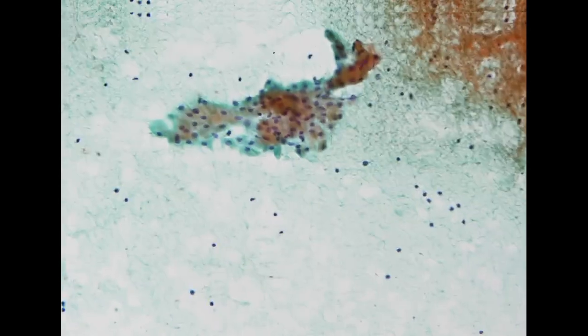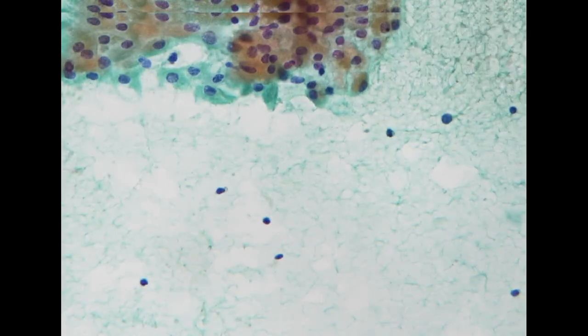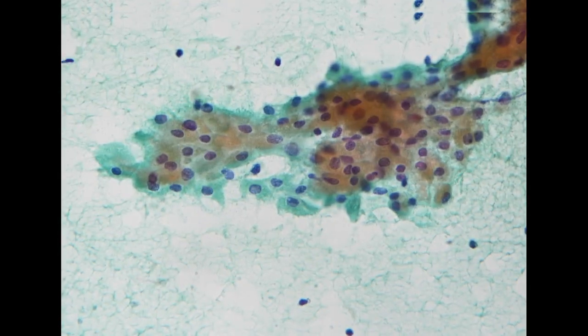So this is the direct smear. Again, sometimes you can see more blood because in the direct smear, we do not process the specimen to wash the blood, unlike in the liquid-based cytology. But we can also see a nice flattened, very bland-looking fragment of oncocytic cells. So this is consistent with a Warthin tumor. This is one of the most common tumors that we will see in fine needle aspiration.